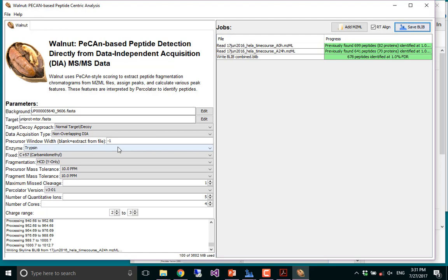Yeah, so it's not uncommon, if you've got two fairly disparate samples, or even a protein that is changing in such an abundance that you can detect it in one sample, but you really can't detect anything real. There might be something integratable, but it's not something you could make a clean detection off of, right? In those circumstances, the program will decide, okay, I found this best in one of my samples. This is what it looks like. This is where to find it in retention time space. And what it's doing is actually retention time warping between both of these files. And if it doesn't see it in the other file, it will actually go and look at that specific spot based on the retention time warping and then integrate that area.